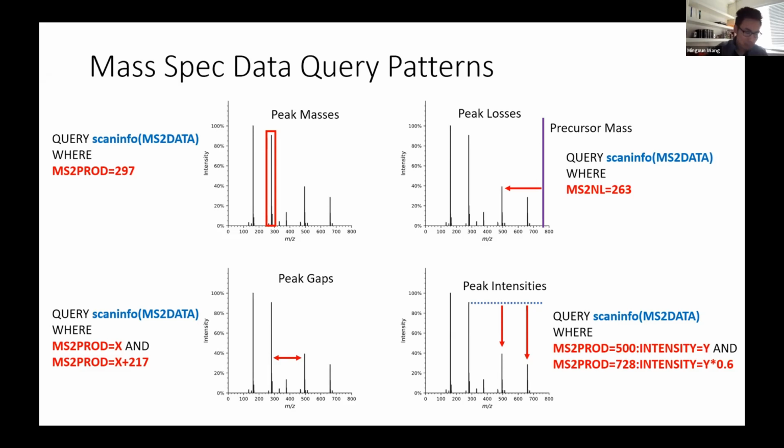So that's number one. But to memorialize it even further, there's a tool called the MassQL compendium, where you can contribute. It's kind of like a spectral library of sorts, right? So you can contribute your query and describe in detail, saying it's looking for this, here's the mechanism, and then that will be reusable by others. I'll show it in a quick second, and people can find it.